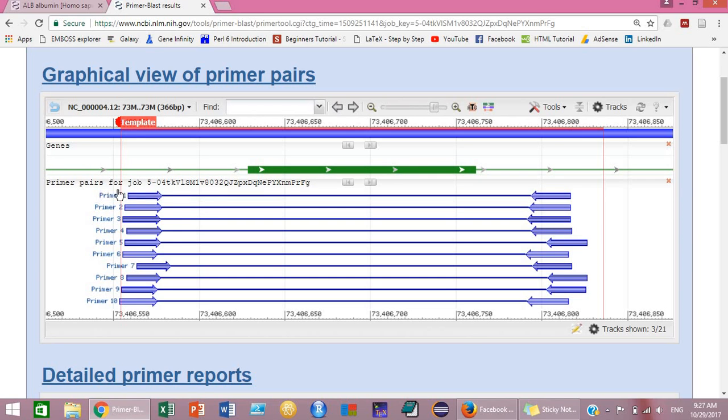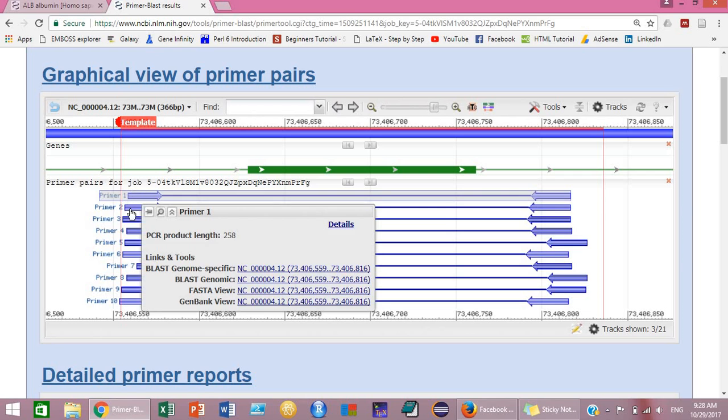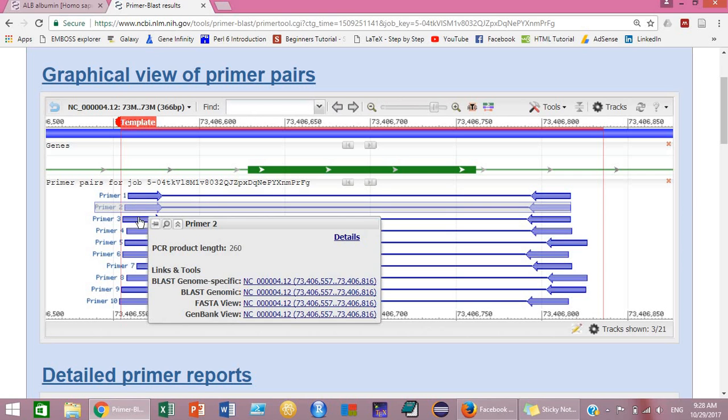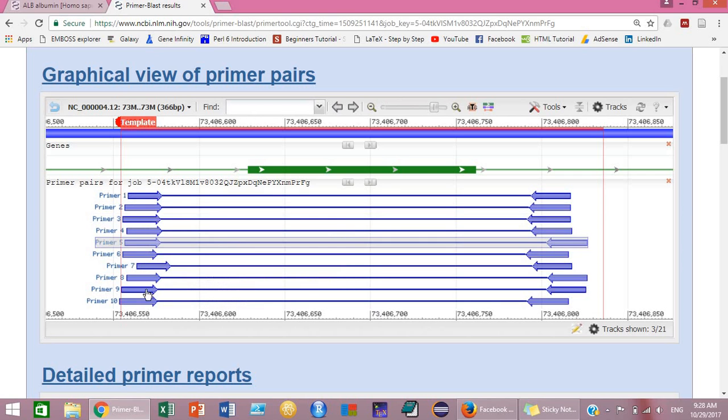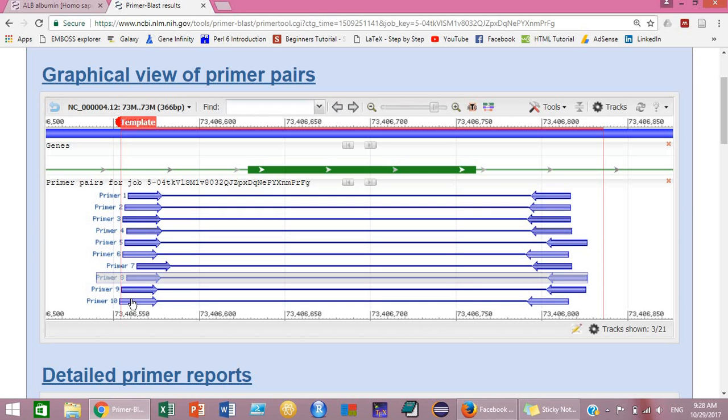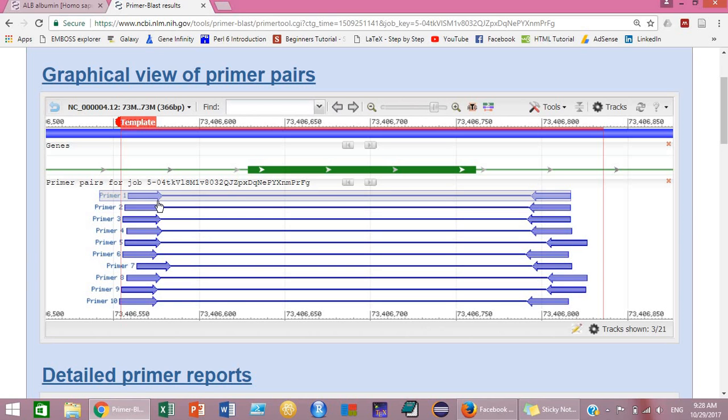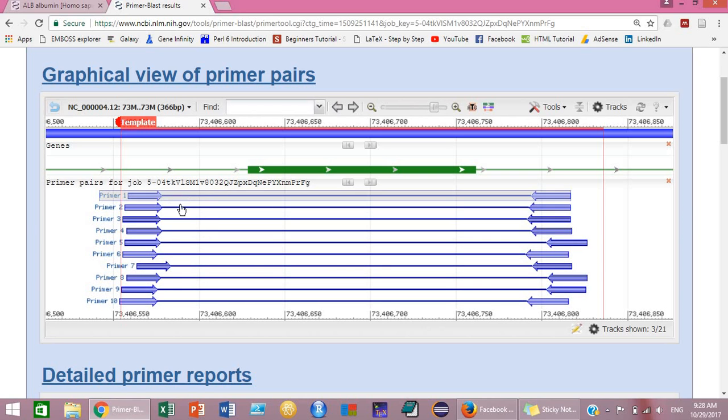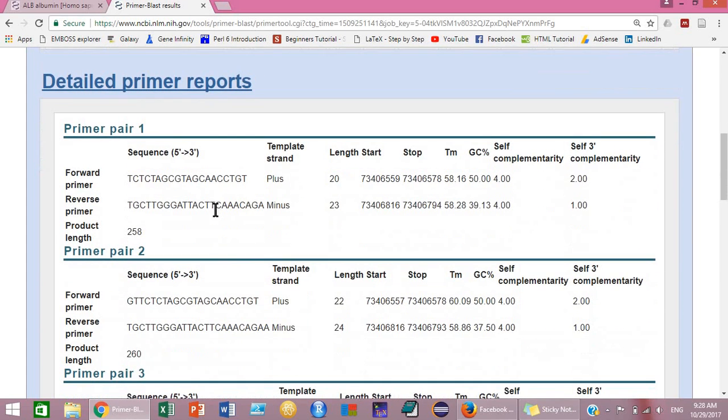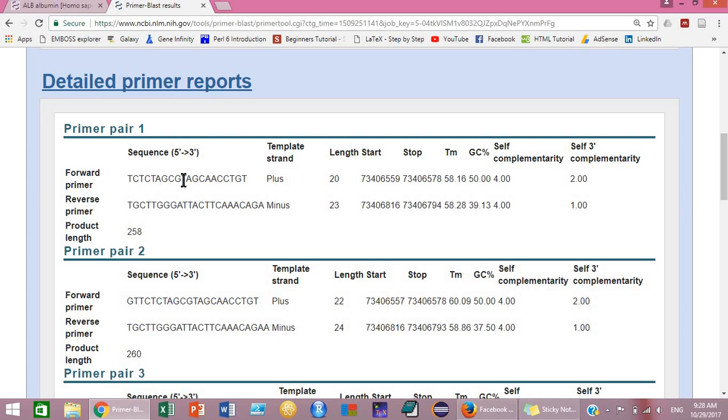Similarly, you can select primer pair 2, 3, 4, or any other primer pair. Here they have prepared 10 primer pairs. If you want to see the sequences of these primers, then you can see them below this graphical view in the tabular view. In the tabular view you can see primer pair one. These are the sequences for the first primer pair.